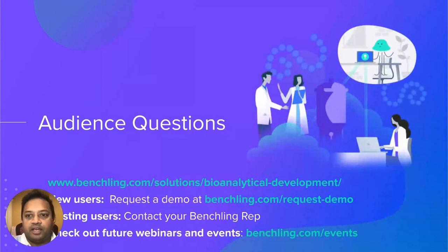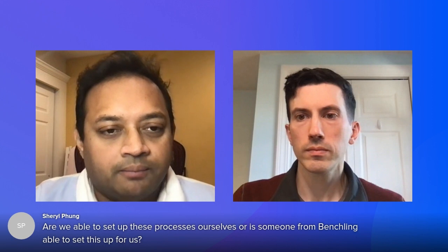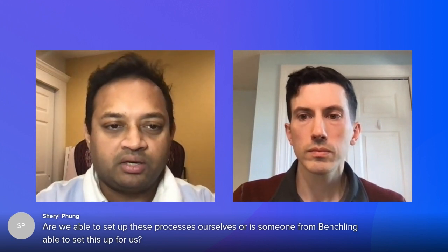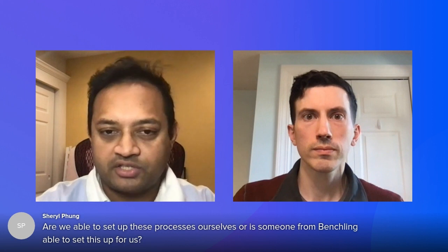So the first question we have is from Cheryl. The question reads: are we able to set up these processes ourselves, or is someone from Benchling able to set this up for us? So maybe Tom, can you answer this question? Maybe talk a little bit about how much of the configuration can be done by customers versus where they might need Benchling services support.